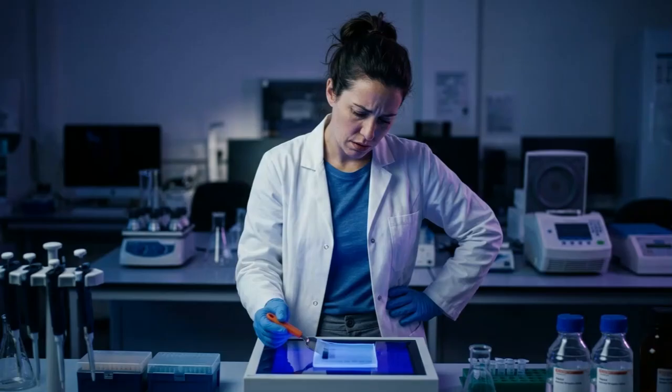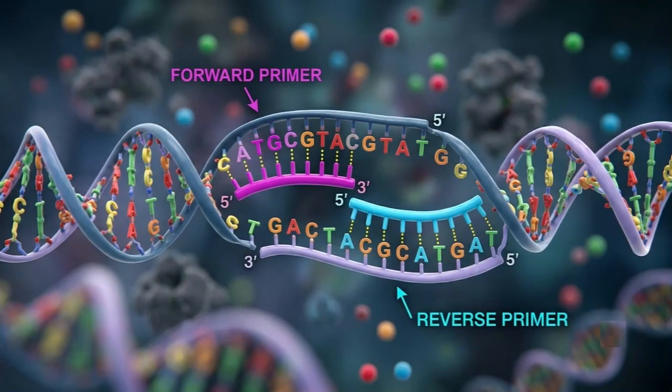It is not your polymerase, and it is not your reagents. The problem often starts much earlier, at the level of primer design. In molecular biology, primers are short sequences of DNA. They define the starting point for DNA amplification in PCR. Without primers, DNA polymerase has no place to begin.